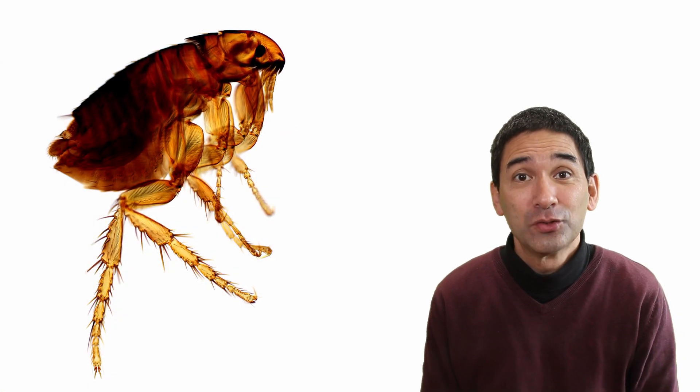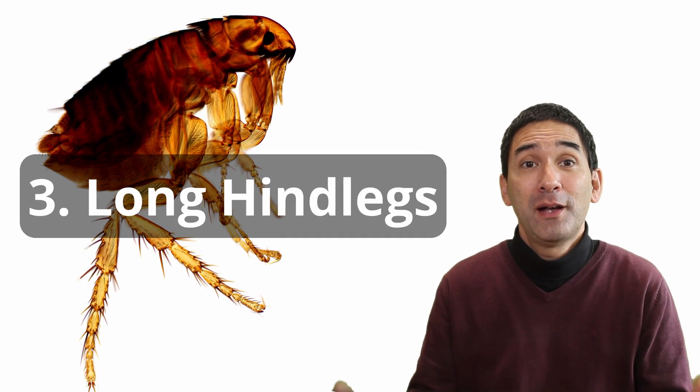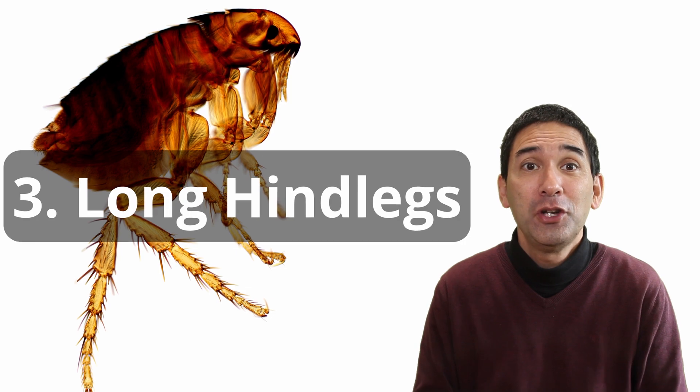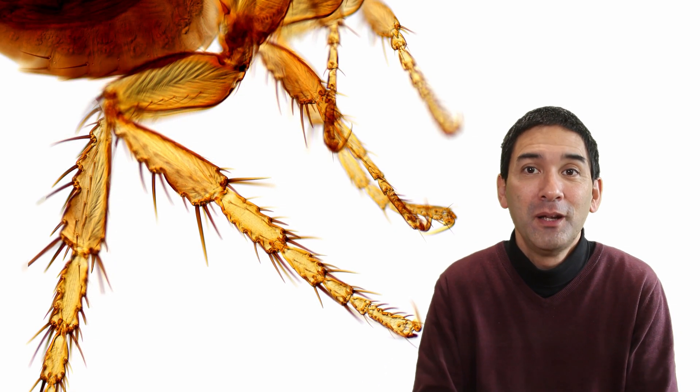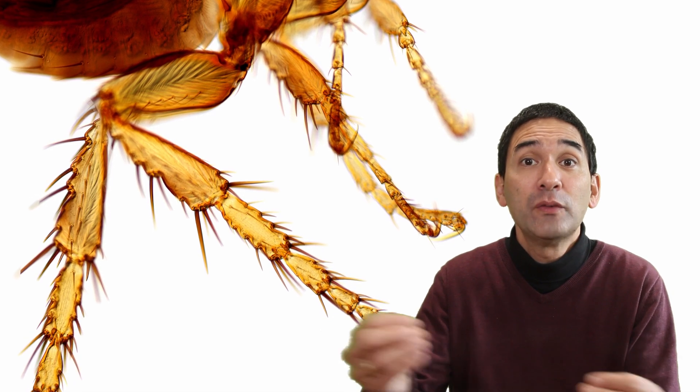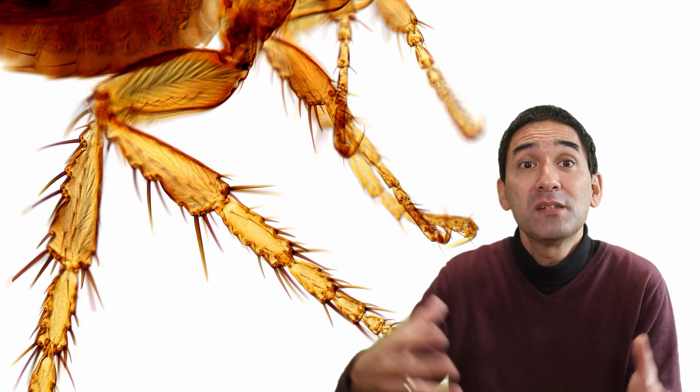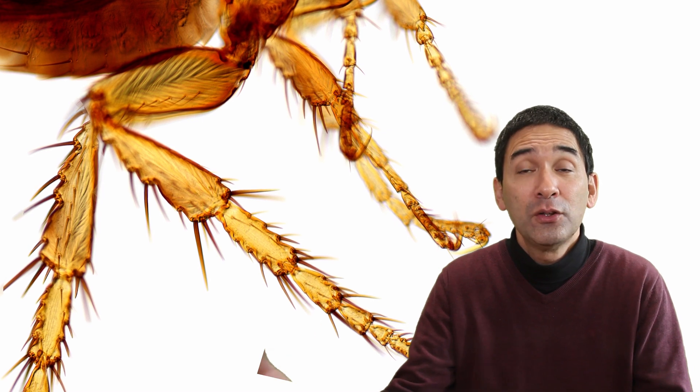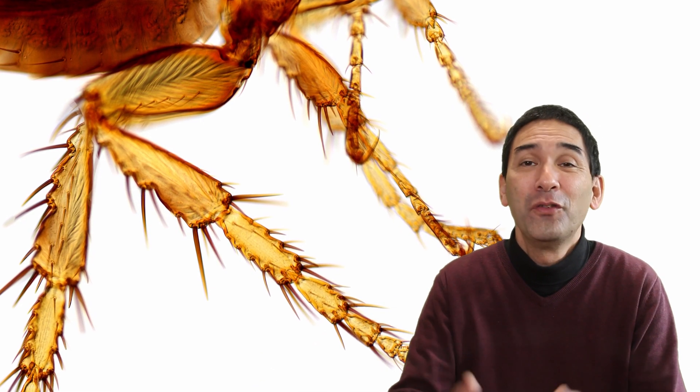Now the third reason is a rather obvious one. Fleas have a pair of very long jumping legs. As a matter of fact, if you look at the image here, the legs even appear to be longer than the rest of the body itself. The long legs allow them to accelerate over a longer distance and this makes them jump faster and of course also increases the distance of the jump.